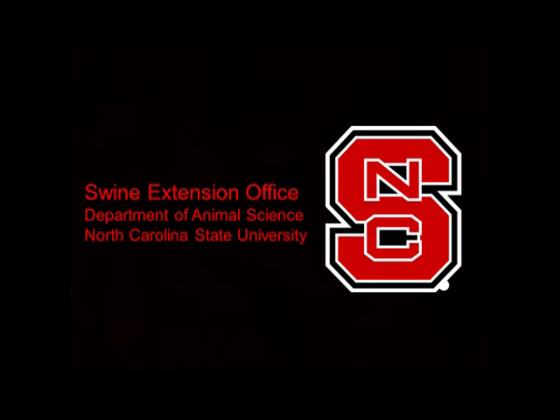for small-scale producers looking to utilize artificial insemination in their breeding herds or to sell semen from superior boars to neighboring farms. In time, the benefits to be gained from good on-farm semen extension and AI will outweigh the initial equipment costs and increase the productivity of the breeding swine farm.